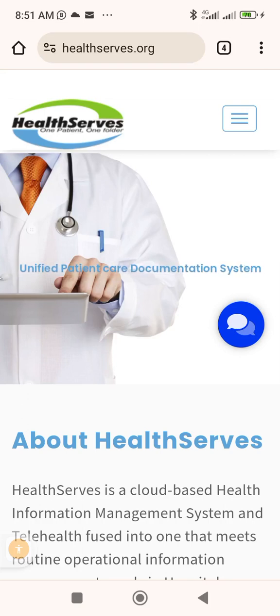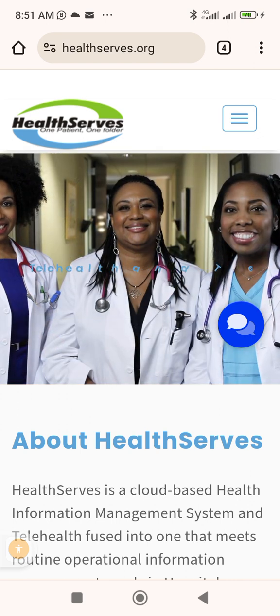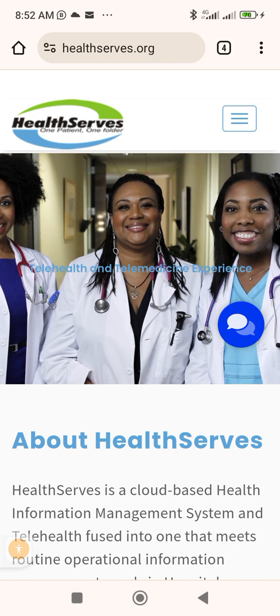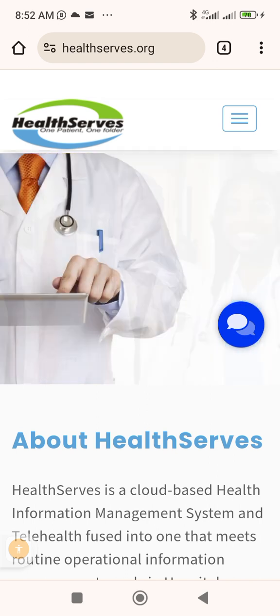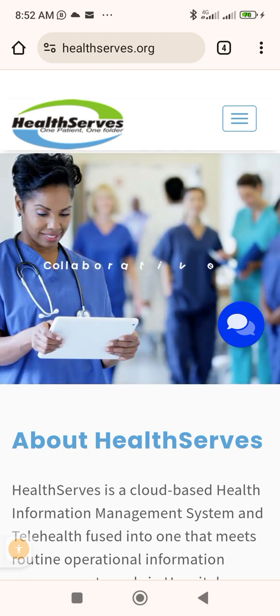All right, you're welcome to this demo, but this is more than a demo. It's more like the basic training of how to run a test using HealthServe software. So please, we implore you to watch it to the end so that you get all the training you need for you to make use of your promo access.